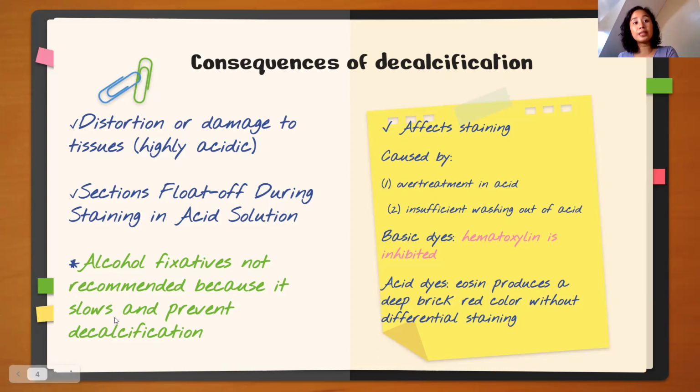So alcohol fixatives are not recommended. Pag nag-decalcify ka, what could happen? It could distort tissues, especially if you use a decalcifying agent which is high in concentration. Ito yung magiging side effect ng decalcification.